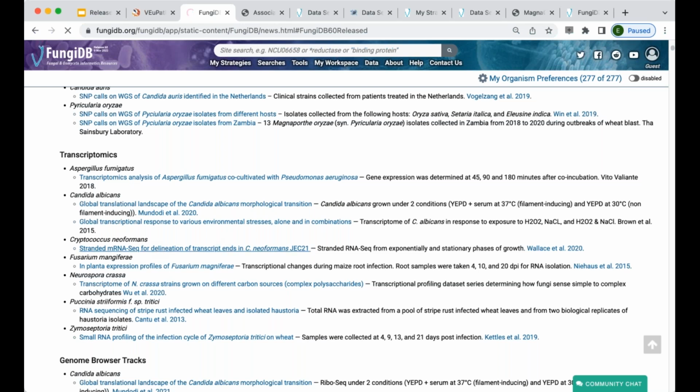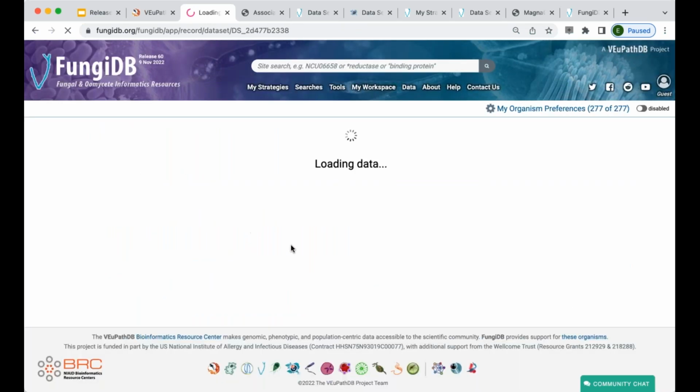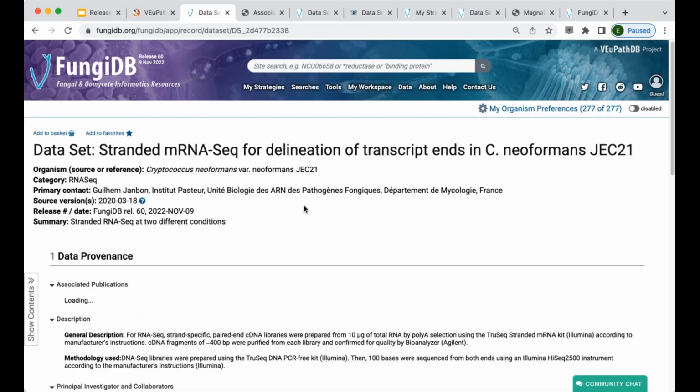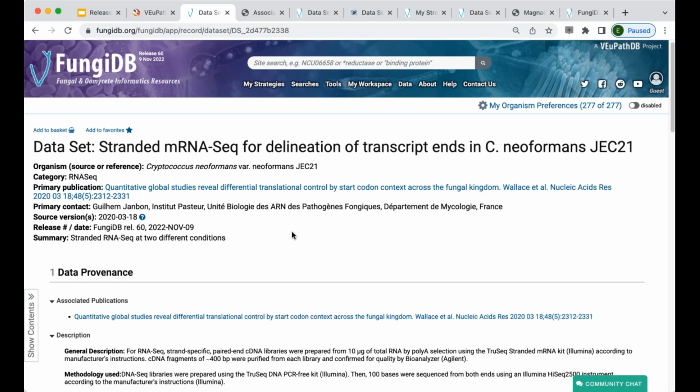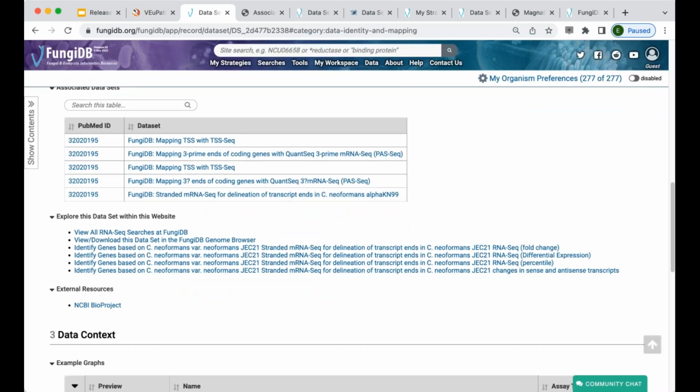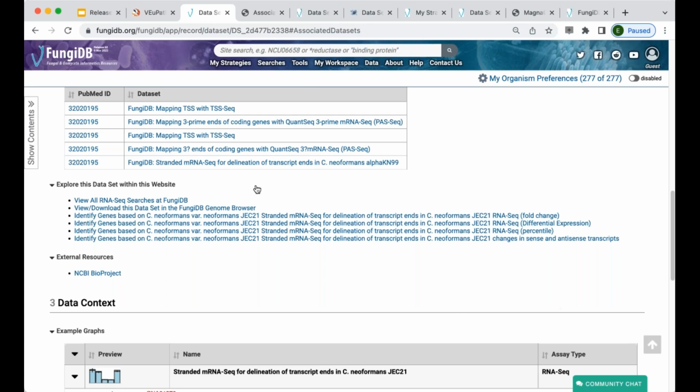And so this dataset is sort of an accumulation of the integration of these series, and you can explore this dataset by navigating to the dataset record page and essentially scrolling down, looking at the type of searches that we have available.